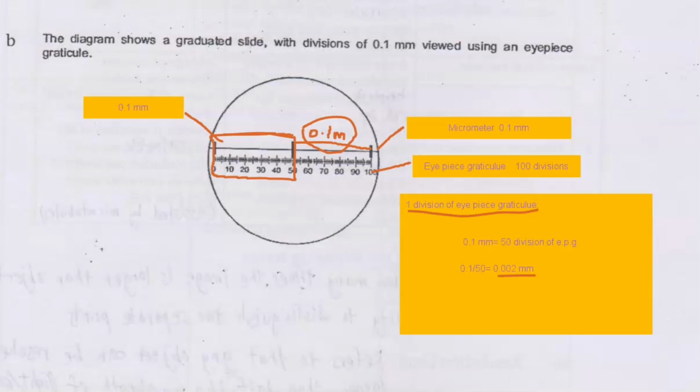For example, suppose we have a cell here, and we can find that it starts from 21 and ends at 61. So it is the maximum width of this cell. We superimpose it with the help of a light microscope.